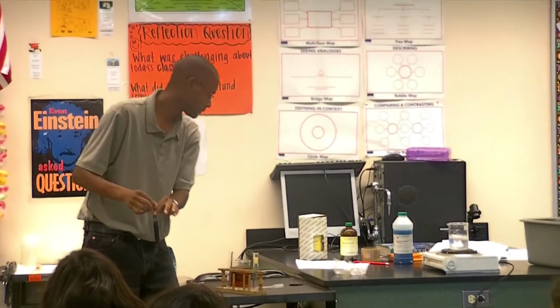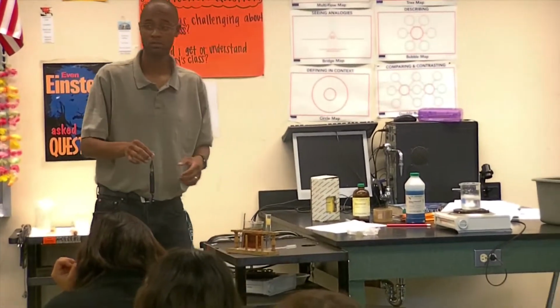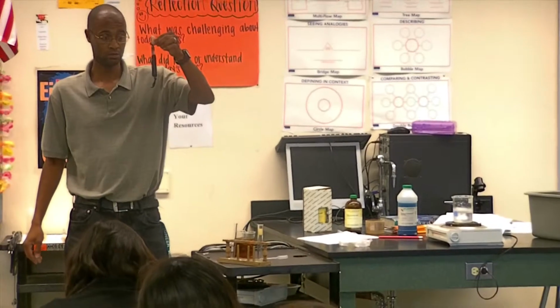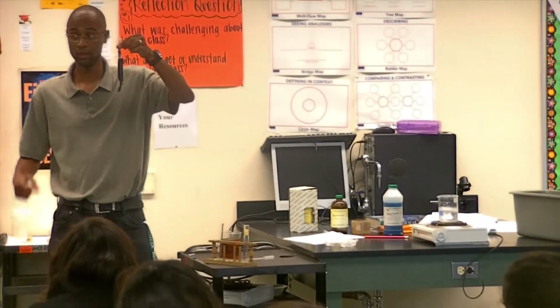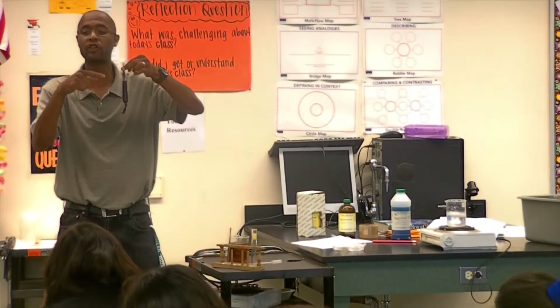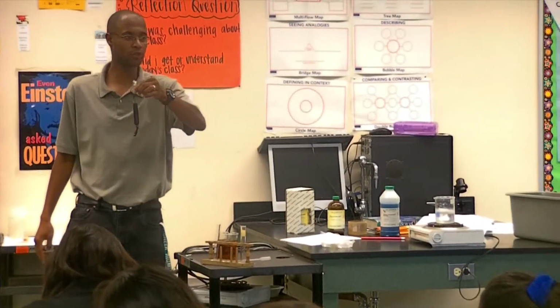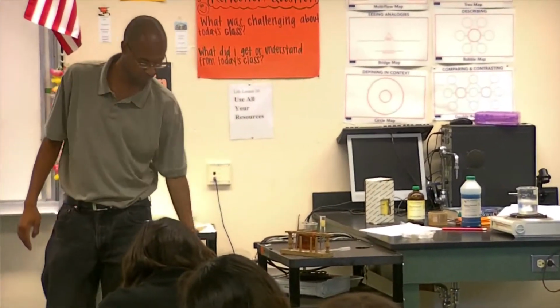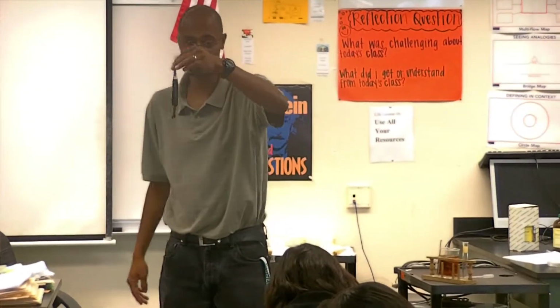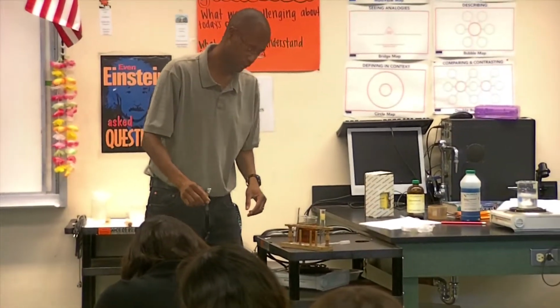Now, let's go to the next one. What was your evidence? What turned black? The starch inside the tube turned black. Just so you know, there's no trick here, and we also looked at the beginning. Alright, next one: the starch.